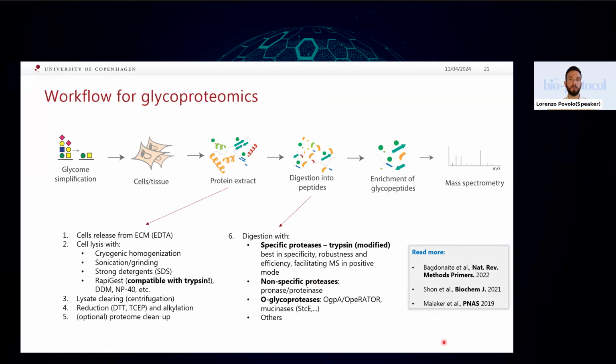So you are essentially interested in proteins in the secretory pathway. That is quite an important question, and I faced the same challenge during my doctoral work. I have recently reported, in a bioRxiv paper, a strategy that we explored in our laboratory for enrichment of transmembrane proteins and proteins in, for example, the secretory pathway.